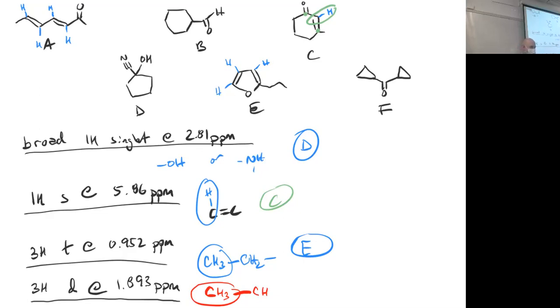Chemical shift, as we have seen, sometimes goes a little bit outside of our expected region. So Sydney, we would expect that CH3 to be between 1 and 1.5, but it was at 0.95, and it was close, right? All right, in this case, you're at 1.9, and 1.9 is weird. 1.9 could mean a couple different things. What would be your expectation? Yeah, could we be two doors down from something? So just trying to match up what we've got. Where do we have CH3s next to CHs? Because this we know for sure.